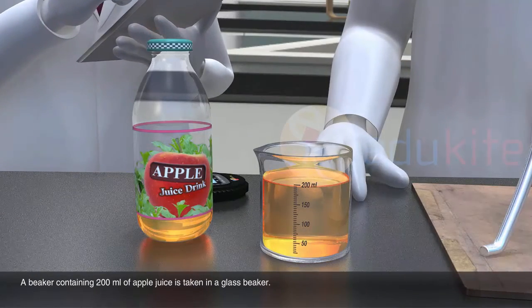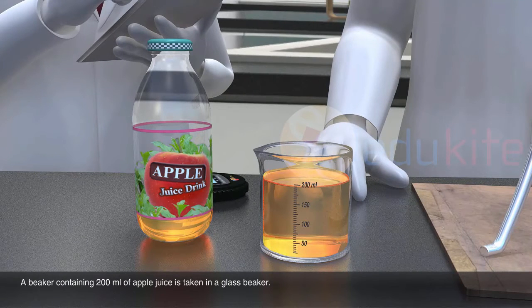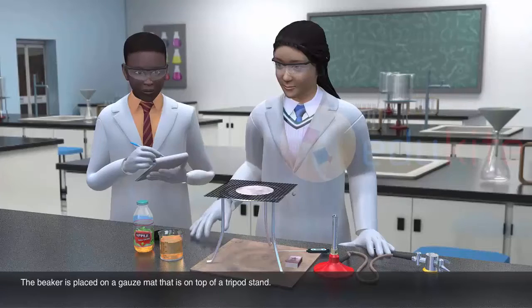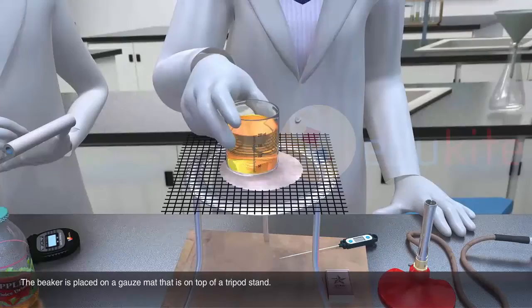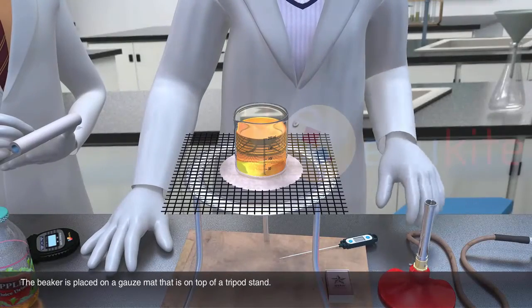A beaker containing 200 milliliters of apple juice is taken in a glass beaker. The beaker is placed on a gauze mat that is on top of a tripod stand.